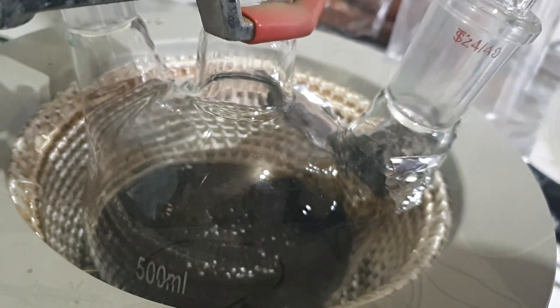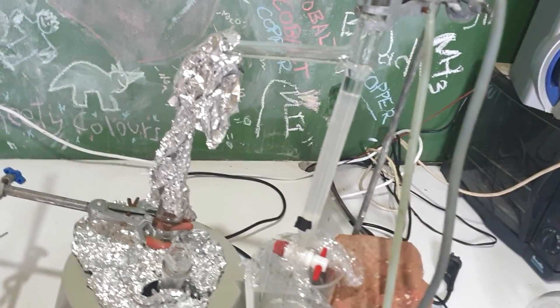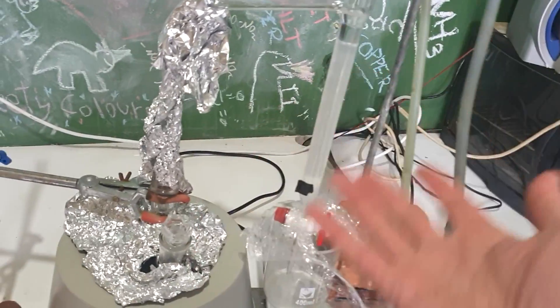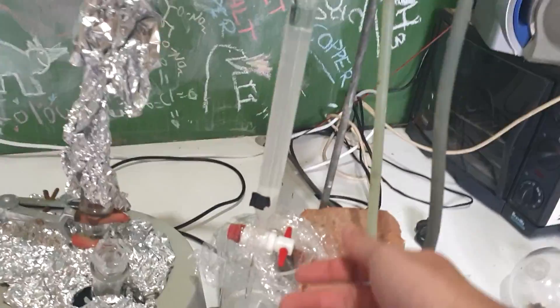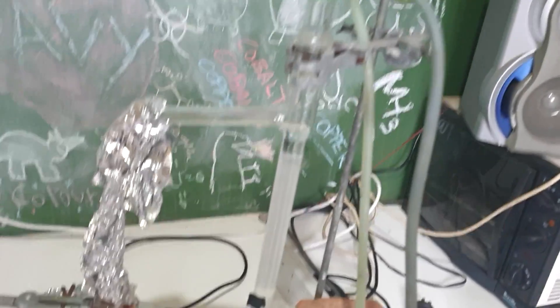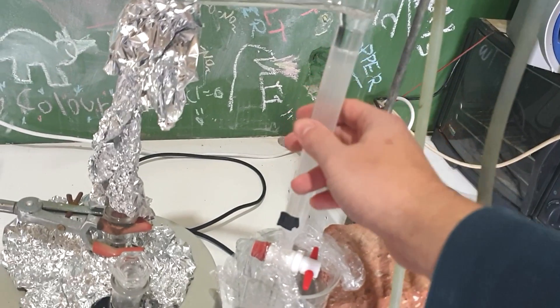It's been refluxing for a total of eight hours now. I know eight hours is a lot short of the 30 hours recommended, but there really isn't a lot more water coming over. The top of that tape to the line is how much water it produced in the last hour. You can see some drops come through occasionally if we wait - there's one - but it doesn't add a whole lot. Ideally I'd let this run overnight but I just don't have the time. What I want to do now is take off the rest of the toluene and see if there's any dioxane that comes off. It shouldn't be too much effort just to change this setup to a simple distillation. Thanks Dean-Stark, you've been helpful but time is up now.